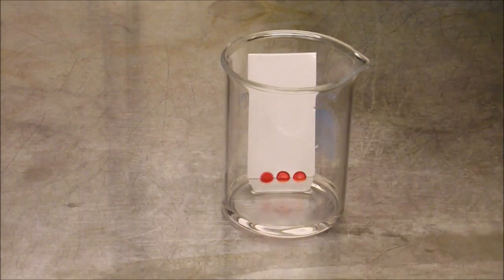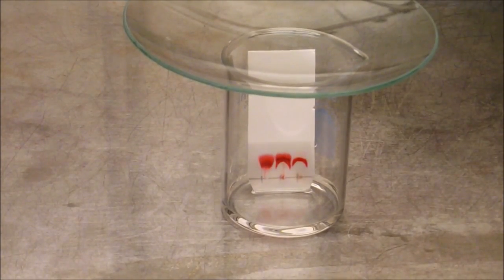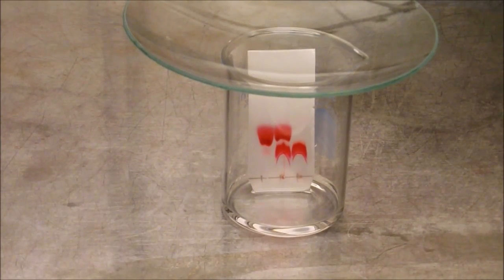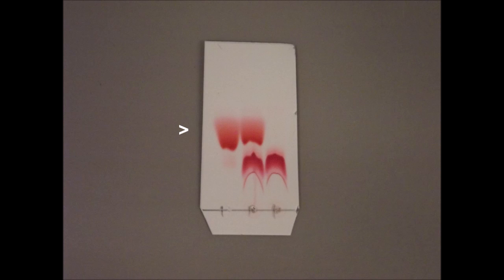Since the reaction is being run in a very polar, high boiling solvent, it is important to run a co-spotted TLC. This TLC plate has three spots: on the left is PDI-bromide starting material, on the right is the reaction mixture, and in the middle is a mixture of both compounds. From the completed TLC plate it is clear that the starting material has been fully consumed and is no longer evident in the reaction mixture on the right.